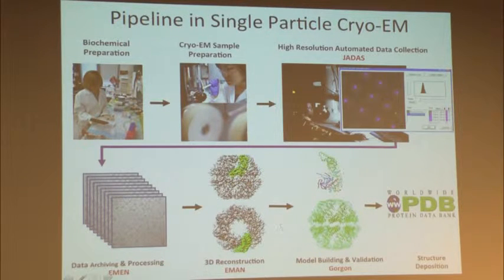Provided you have the material on hand, the next step is to prepare the specimen. The word cryo-EM means you prepare the specimen at low temperature, in such a way that you keep the specimen in frozen hydrate, at the buffer condition that the biological experiment you are interested in requires. Then you put it in the electron microscope, which provides you two-dimensional images of your three-dimensional objects. If you have single particles, that means you have an individual 2D image of each single particle, and so you have a stack of images from different specimen areas.